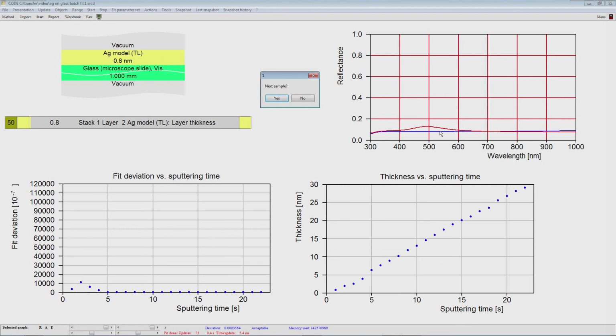And so this happens in the first seconds. So for 2 seconds there is still the structure. It's getting weaker and it moves to higher frequencies or smaller wavelengths. At 4 there is a little bit left here of this bump, but it already looks a little bit like what we get from the simulation.